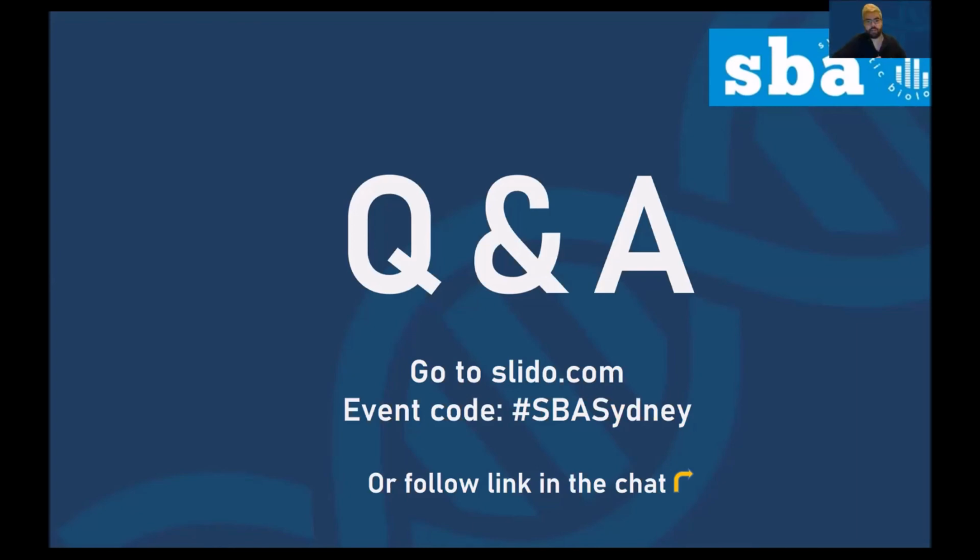The next question from Leonardo: very fantastic talk, Andreas. How stable are these nanoliter bioreactors, and how do you supply oxygen? They are very stable. They have some stuff that they don't like, but in principle, they are temperature stable and medium stable. You can do PCR in them, so you can heat them up to 95 degrees, and you can put them in typically all cultivation media that we use. Oxygen is not a problem because we just take the nanoliter reactors and put them in a shaking flask and put them on the shaker.